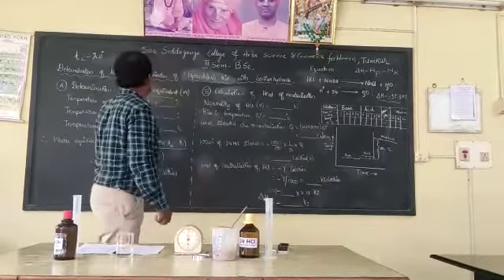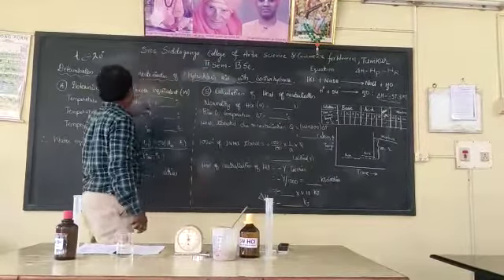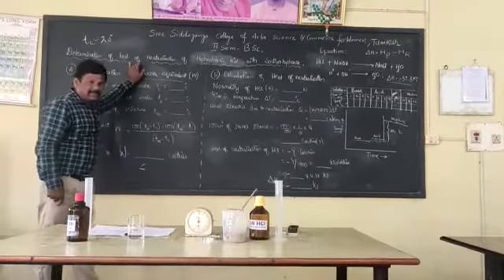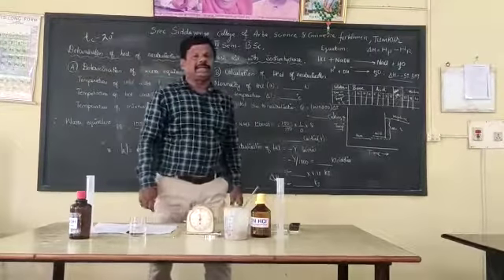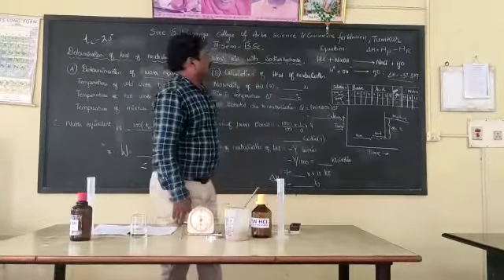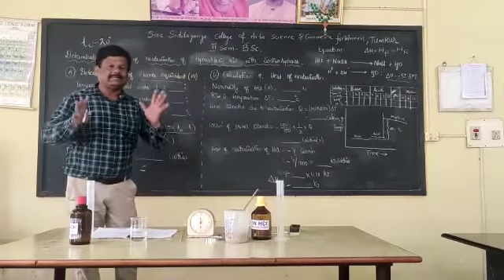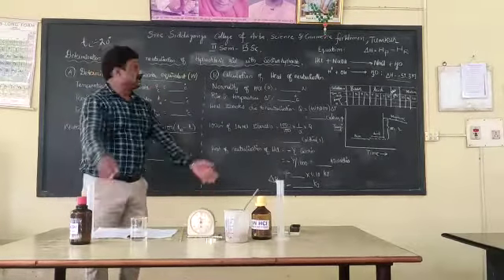That is our question. With respect to that, what is enthalpy of neutralization? Enthalpy of neutralization is nothing but the enthalpy change that occurs when 1 gram equivalent weight of an acid is completely neutralized by 1 gram equivalent of a base in dilute aqueous solution. So what is enthalpy change? Enthalpy change is nothing but the difference between the heat content of the product and that of the reactant.